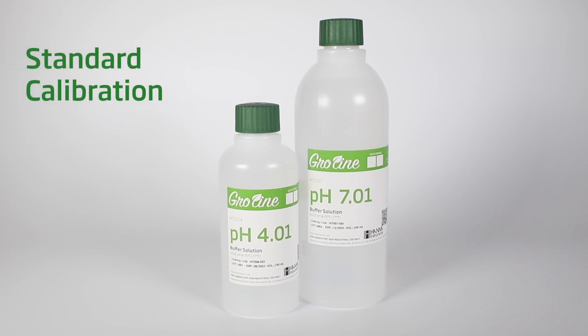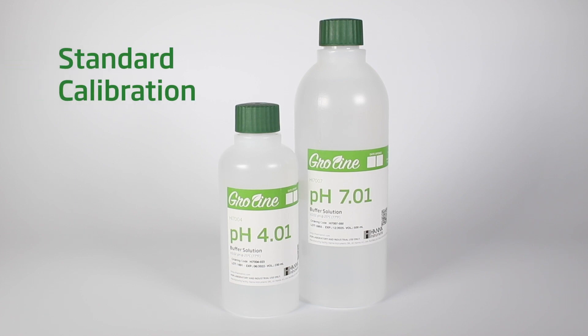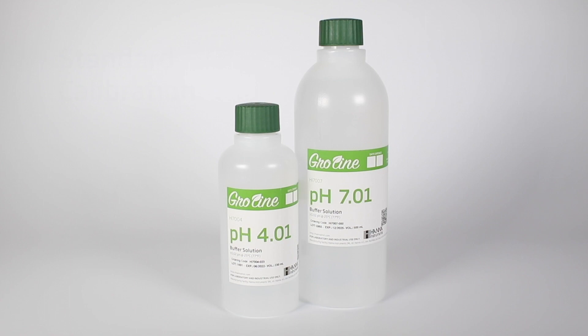Let's perform a two-point calibration in standard calibration mode. You may use any brand of pH 4 and pH 7 calibration solution for standard calibration. It also allows for the meter to display probe health.